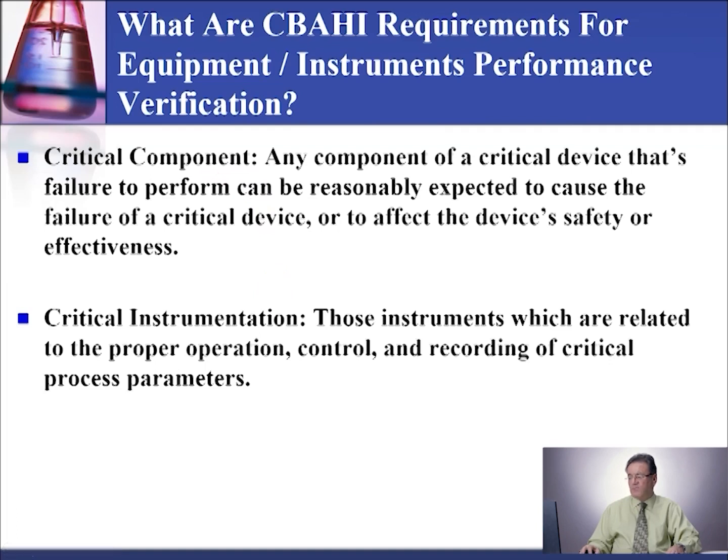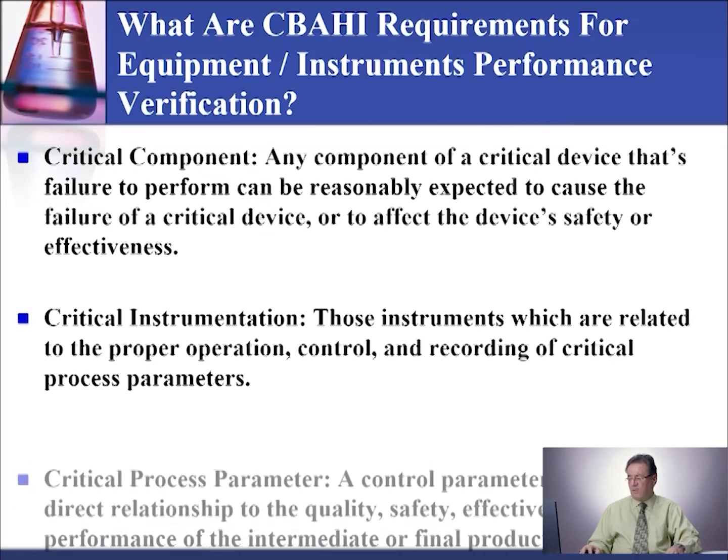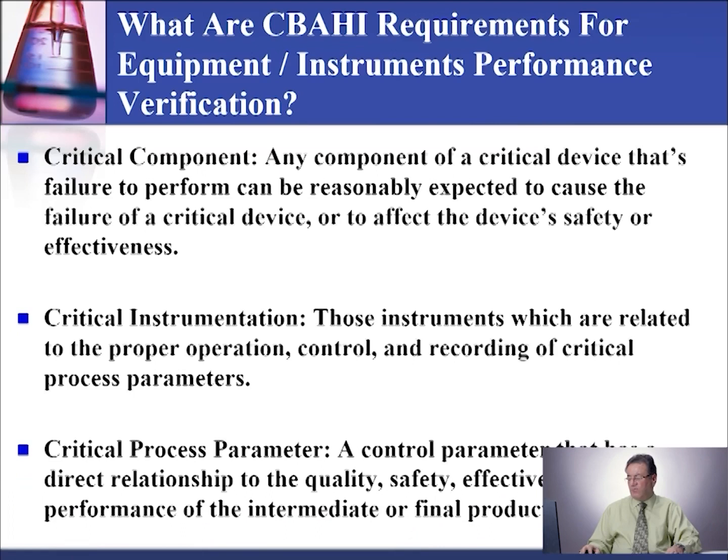The purpose of operational qualification is to challenge whether the instrument, system operation, parts, utilities, and other components are functioning correctly in compliance with the set specifications, simulating actual testing conditions including worst case situations, by repeated testing a sufficient number of times to assure reliable results and consistency.